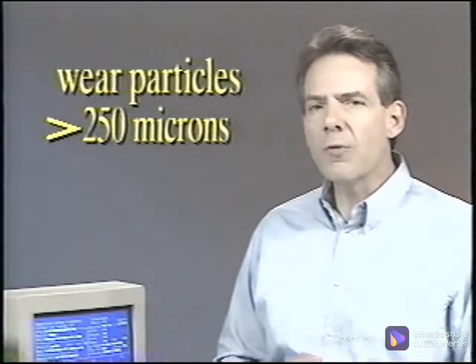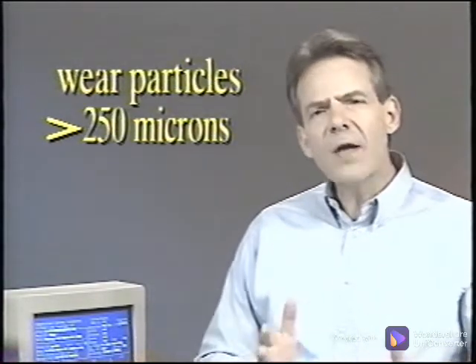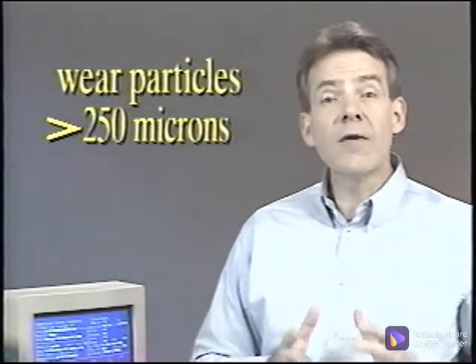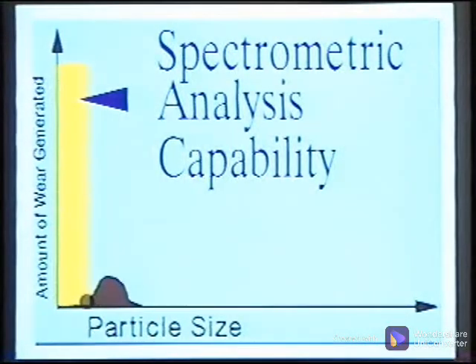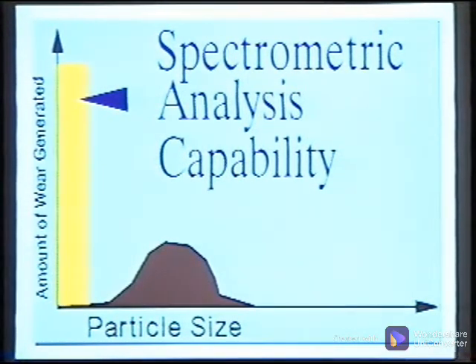When the sample was tested again for large wear particles, it had excessive ferrous fatigue wear chunks in excess of 250 microns. They were so large, they were ignored by the spectrometric oil analyzer. A failure progression typically begins with wear particles in the 10 to 20 micron range, increasing in size and number until failure.